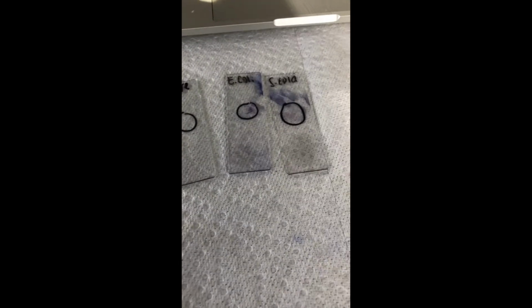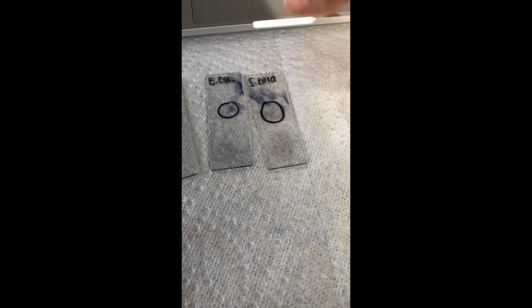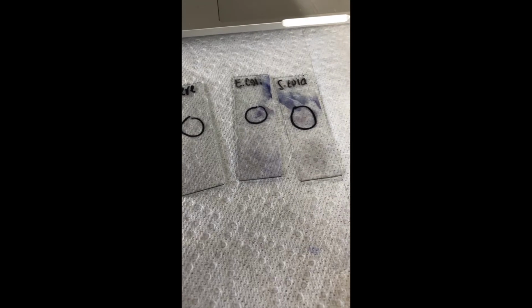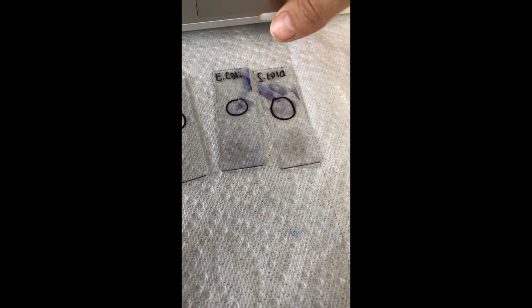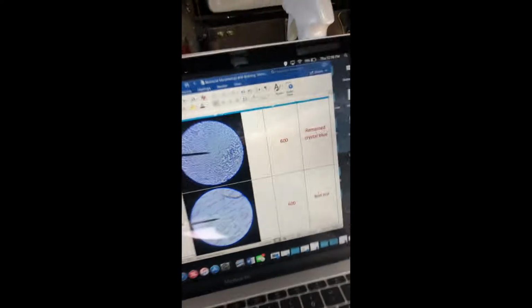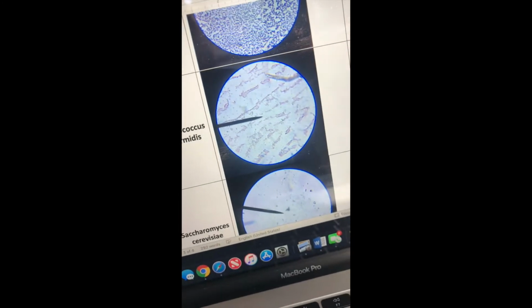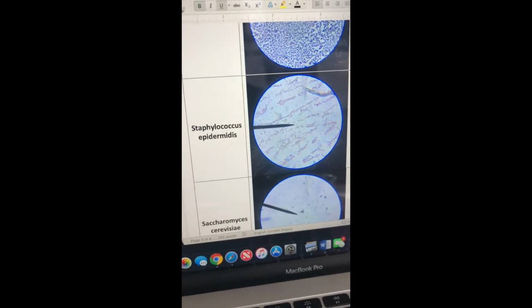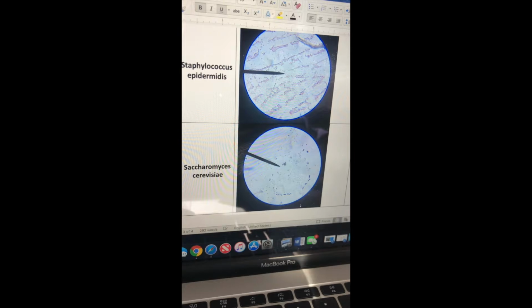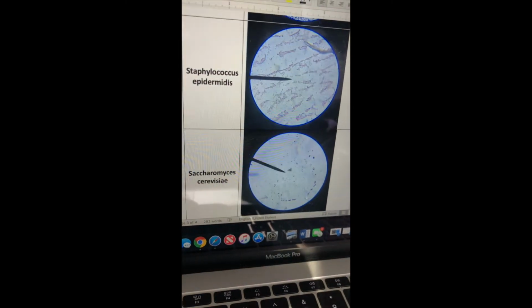This process is to determine whether a culture is gram positive or negative, in which gram positive cultures have a thicker wall, so they will keep the crystal violet dye, which the E. coli culture seemed to do, and then the Staphylococcus epidermidis had the red tint, and then the Saccharomyces cerevisiae actually kind of remained colorless throughout the portion.